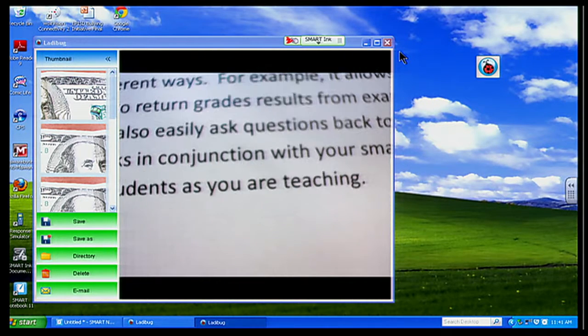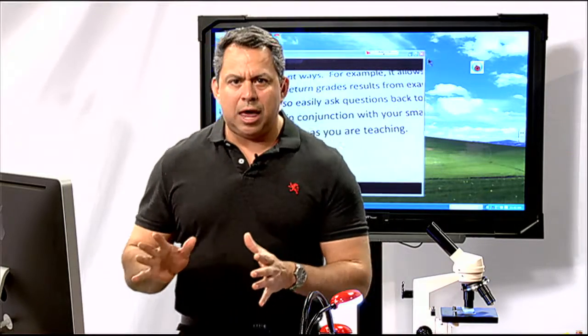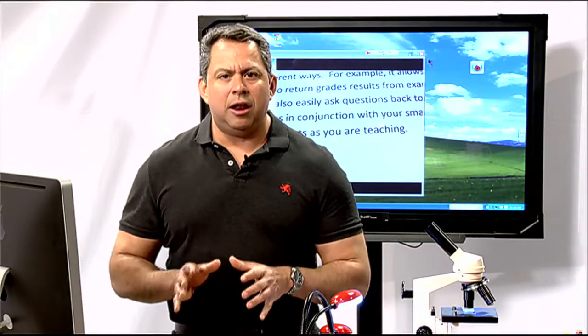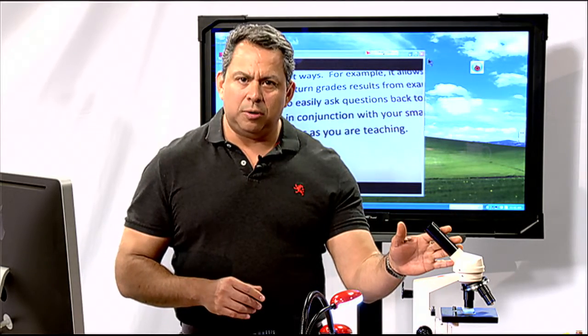And there it goes. It just takes a little bit of time. But now I've got a good image on that. And so now I'm ready to actually connect my Lumens camera onto my microscope here.